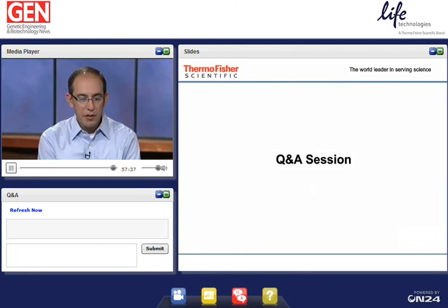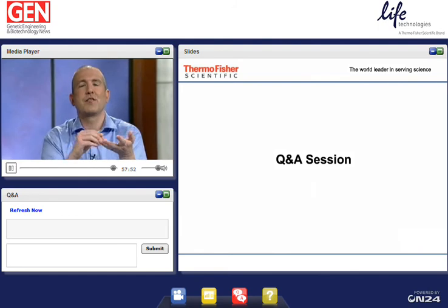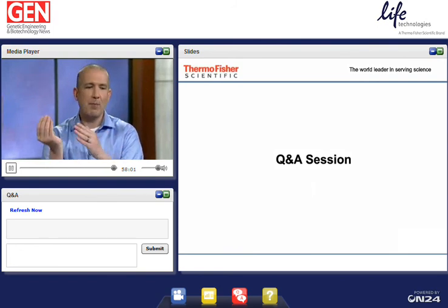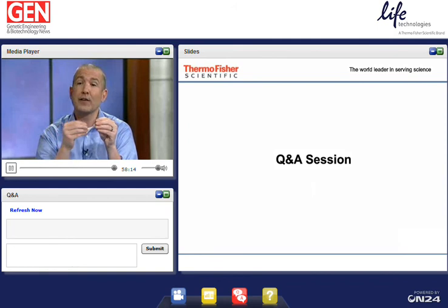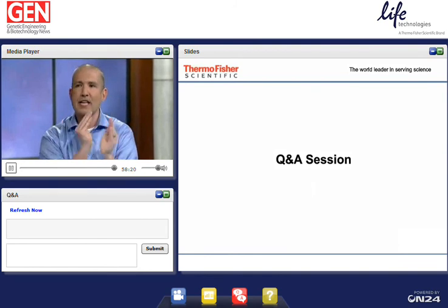Great. This one, maybe David or even Thomas, you talked about fluorescent detection and multiplexing. Question is, can I use two different secondary antibodies at the same time? So, for example, a housekeeping and my protein. Oh, secondary or primary, I think. The key with infrared fluorescence, two-channel fluorescence, the beauty of that is that a lot of people have run for many years, they've done band normalization with, let's say, a beta actin or a GAPDH as a housekeeping. But what they would have to do is cut horizontal strips. The reason they did that is because they were using chemiluminescence. They didn't know the degree of cross-reactivity between their primaries, so they would spatially separate them so that they didn't have to worry about any cross-reactivity.